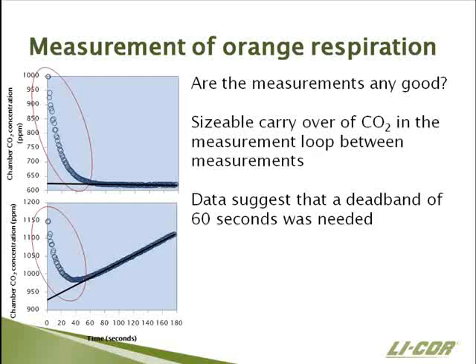And so when you switch from chamber to chamber, there's a volume of gas trapped between the solenoid manifolds and the 8100 that's going to be at the maximum CO2 concentration from the end of the measurement at the previous chamber. And when you switch to the new chamber, it takes some time for that to flush out and come into equilibrium with the chamber before you can start detecting the increase in CO2 concentration in the chamber that you need to make the flux measurement.